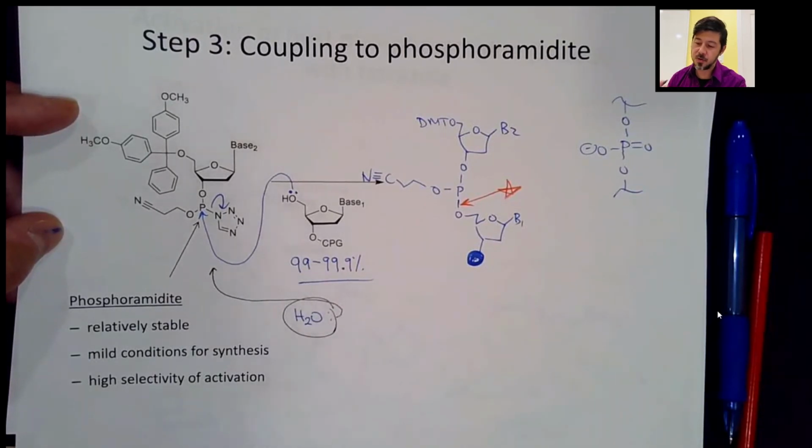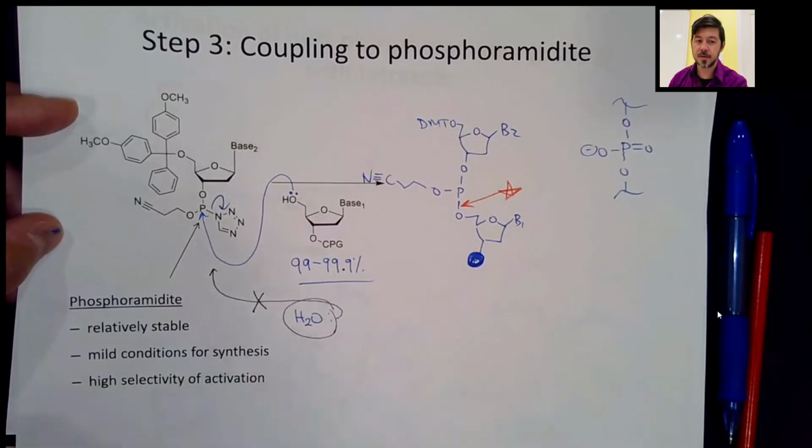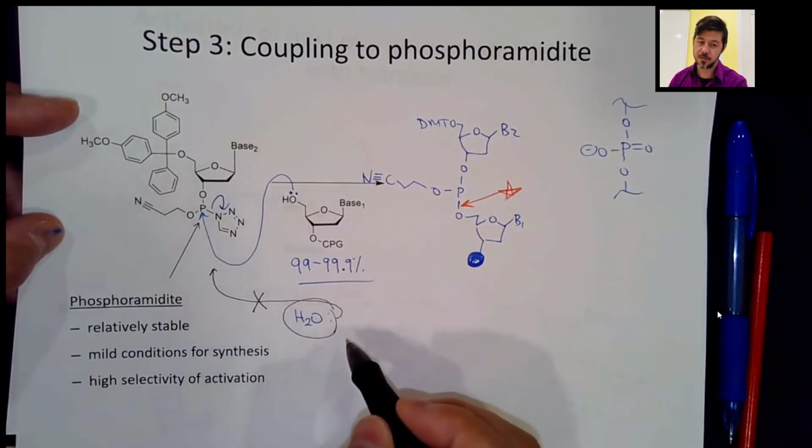So it's really important during this chemistry, and I'll show you a picture of a machine, that we use anhydrous solvents, so solvents that don't have any moisture in them, and we do these under argon or nitrogen gas, so that moisture from the air does not compete with this reaction. So on hot, humid days, even in a controlled fashion, we try to avoid using the synthesizer because inherently just a little bit of moisture in the air can compete with this reaction.